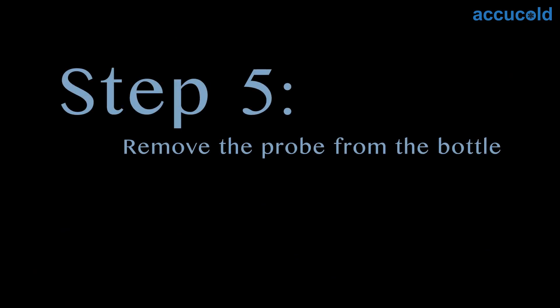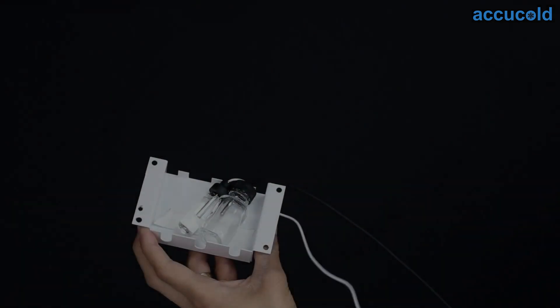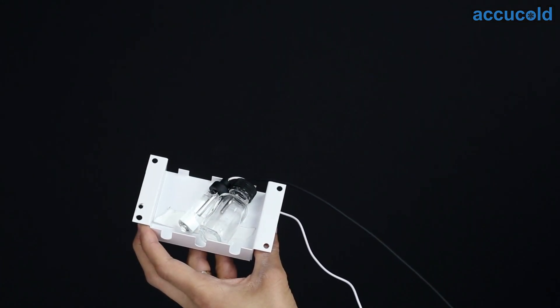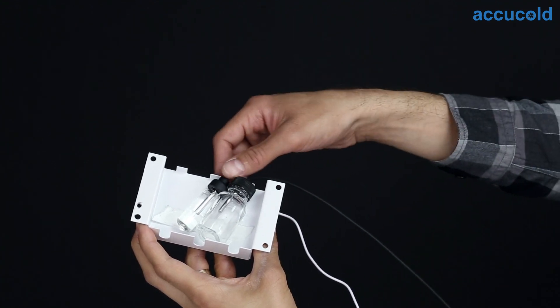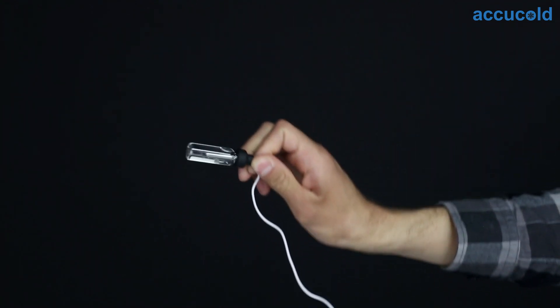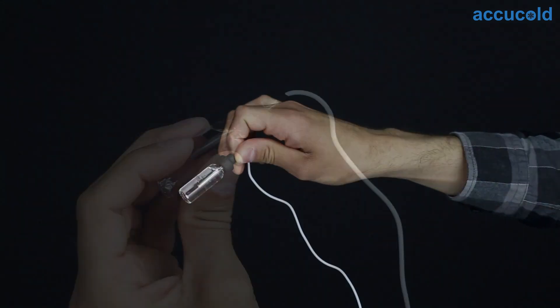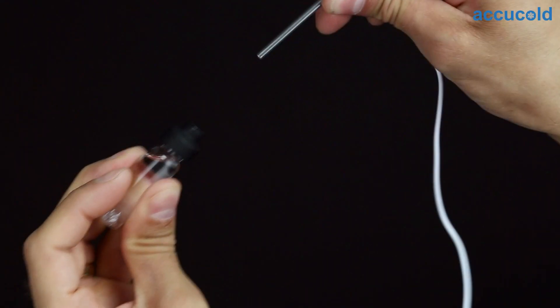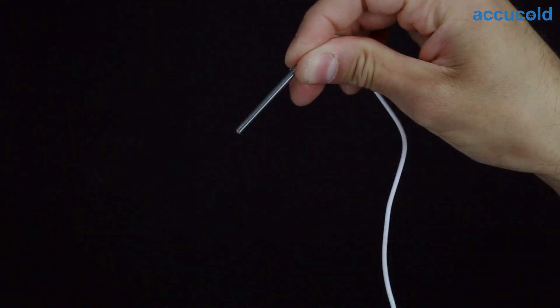Step five, remove the probe from the glycol filled bottle. The probe is located in a bottle attached to the bracket. There may be more than one probe, depending on your unit. Locate the bottle filled with glycol and remove it from the bracket. Gently pull the probe from the bottle and set the bottle aside.